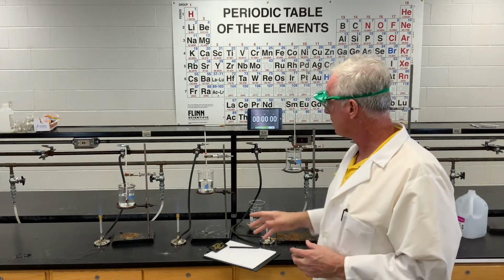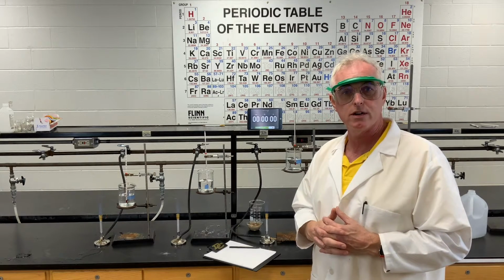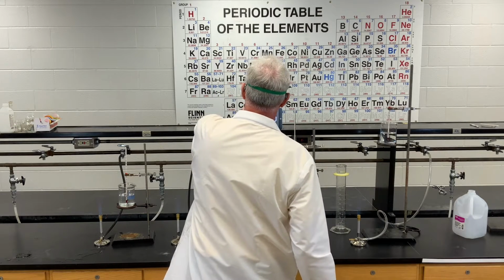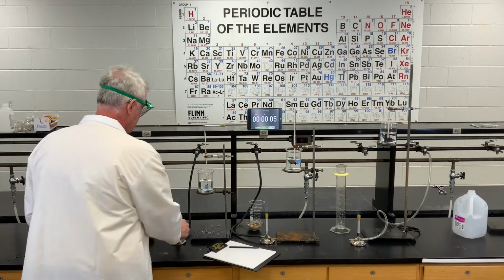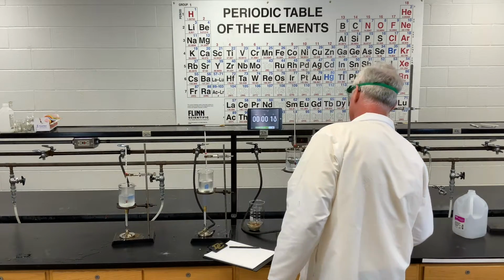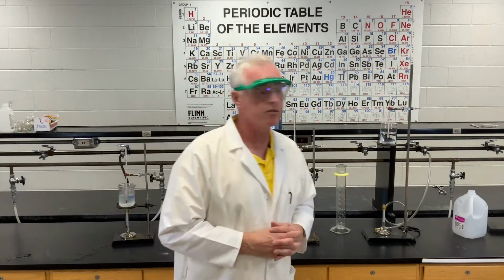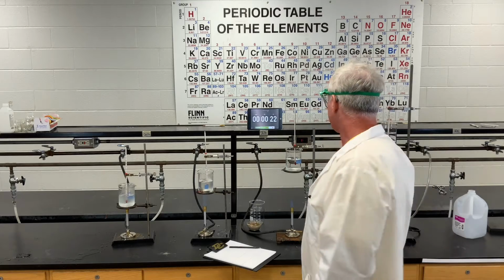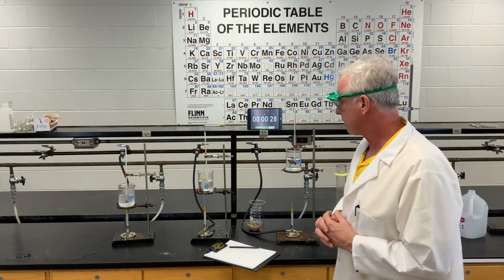I'm gonna start the timer, put them under, and let the heating begin, and we'll just see which one does best. Start here. And there we go, all overheating. Started with every one of them having the exact same amount of water. I measured it in a graduated cylinder, exactly 250 milliliters. Put a thermometer in each. They all started out at 22 degrees Celsius. And so now we'll just wait and see.